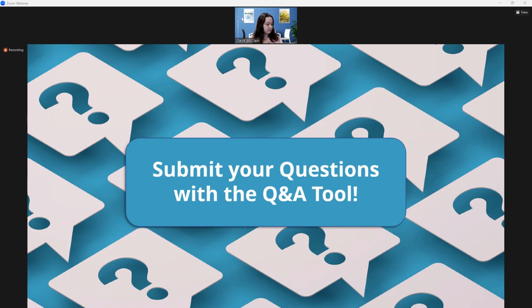Let's see. Our first question is, can I process different sample types than soil, stool, and water with the MagBind Environmental DNA kit?